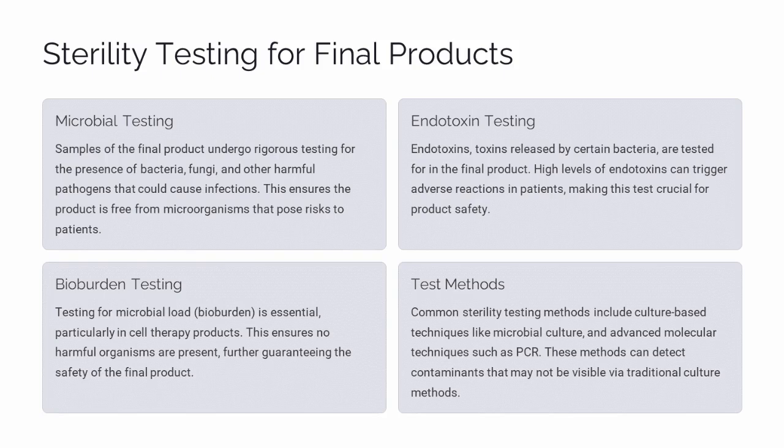Sterility testing for final products involves microbial testing, endotoxin testing, bioburden testing, and various test methods. These tests ensure that the final product is free from harmful pathogens and safe for patient use.